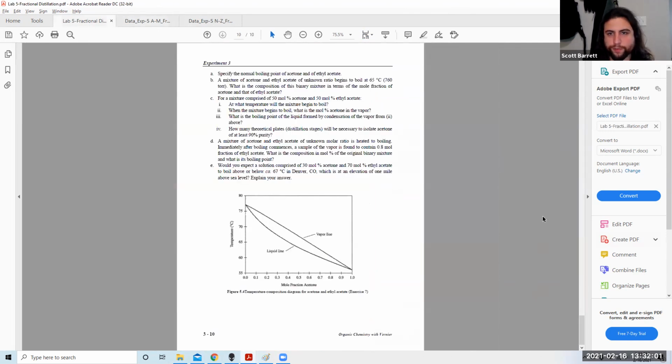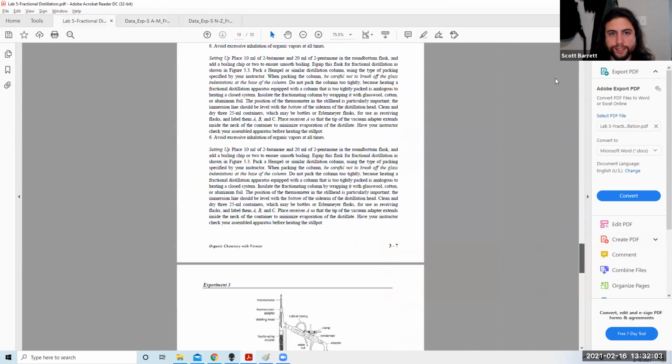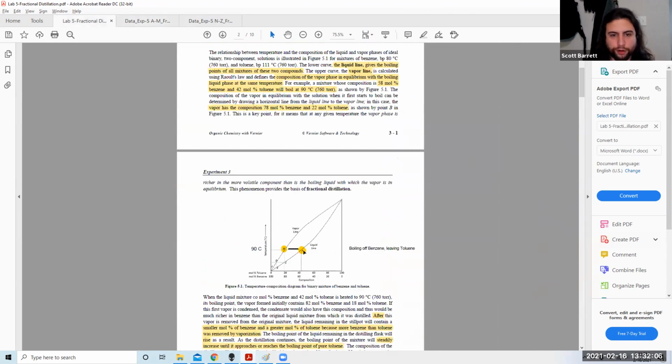And so that kind of refers back to when we were talking about the separations. At first, you'll get a large quantity of the more volatile substance coming over, and the less volatile substance condensing back down into your still pot. And as you slowly keep increasing the temperature, less of the more volatile substance is present to distill over. And as you keep increasing the temperature, you eventually will get to the boiling point of the less volatile substance in the mixture, in that case, the 2-pentanone.